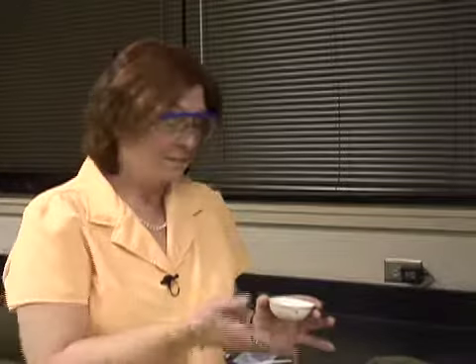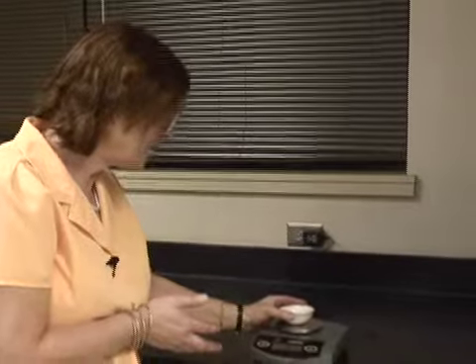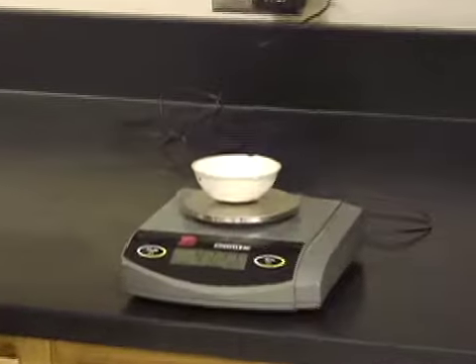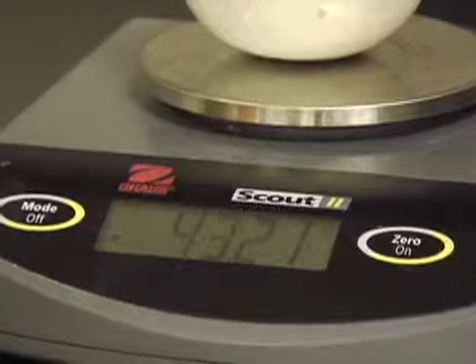Now we have let the evaporating dish cool completely. Remember, we cannot weigh anything that is at all warm. It must be completely cool. And then I'm going to put it on the balance in the middle of the pan. And it has a mass of 43.21 grams.